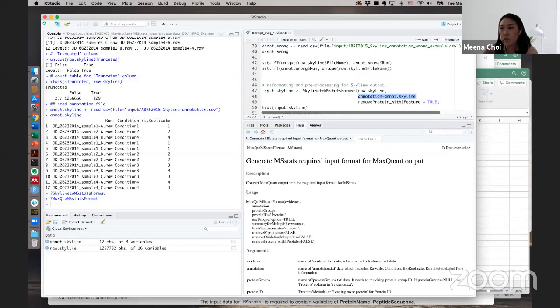DIA part. For DIA, we commonly have a really big data set, especially the spectral output, which is much bigger than other data sets. For our testing, the data up to 45 runs works well for up to several thousand proteins. However, we also received reports that some cases have a problem with RAM issues. We are aware of this.